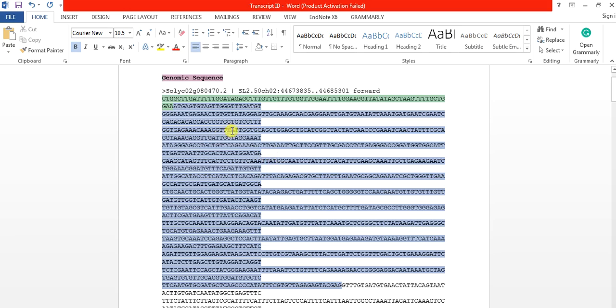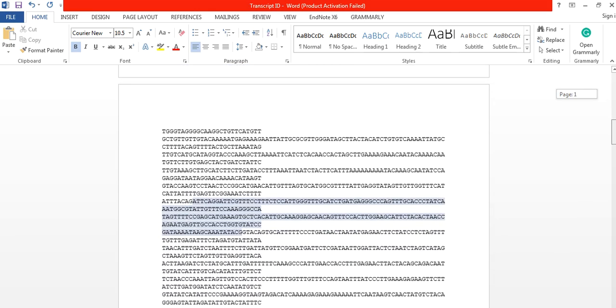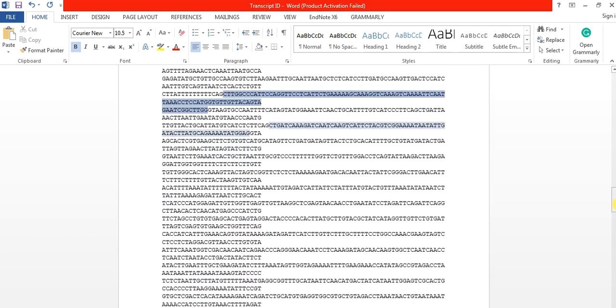from your genomic sequence. But remember that the 3' and 5' ends of your sense or antisense primer sequences must be from the exonic region. Like this genomic sequence contains the exonic sequence as well as the intronic sequence, or coding regions and non-coding regions. These highlighted base pairs are coding regions, while these non-highlighted ones are non-coding regions. When you download it from Phytozome, it will come in this shape, and it clearly tells us which base pair is coding and which one is non-coding.